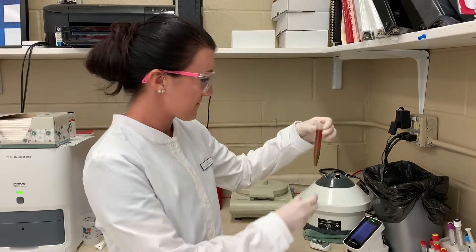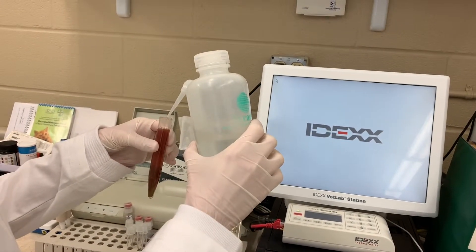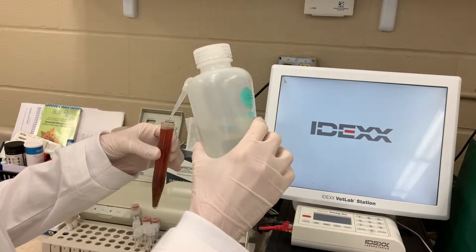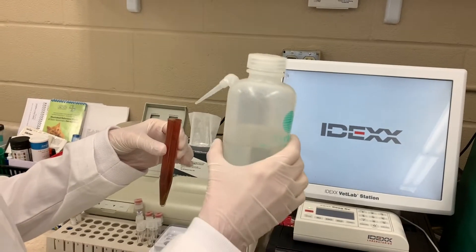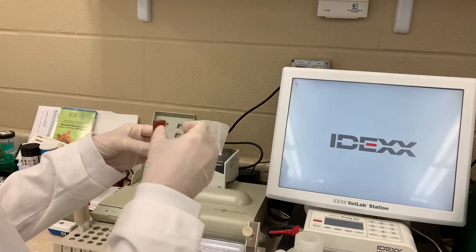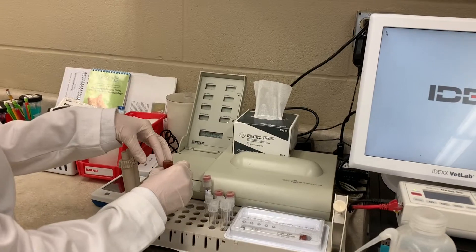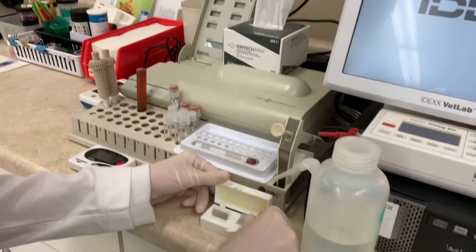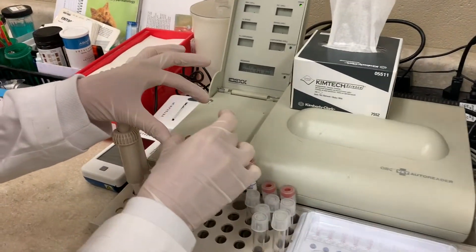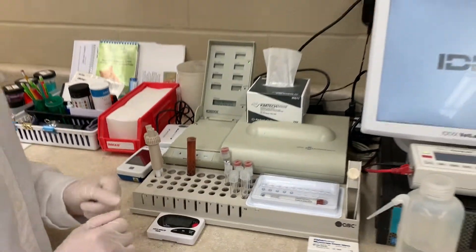We'll go ahead and start that and start the timer. Now that the centrifuge is done spinning, we'll take a look at our sample. I'm going to add more flotation solution to kind of form a meniscus. I'm going to gently place it in one of these slots and place a cover slip on it. We're going to let this sit for 15 minutes — I have a 15-minute timer started.